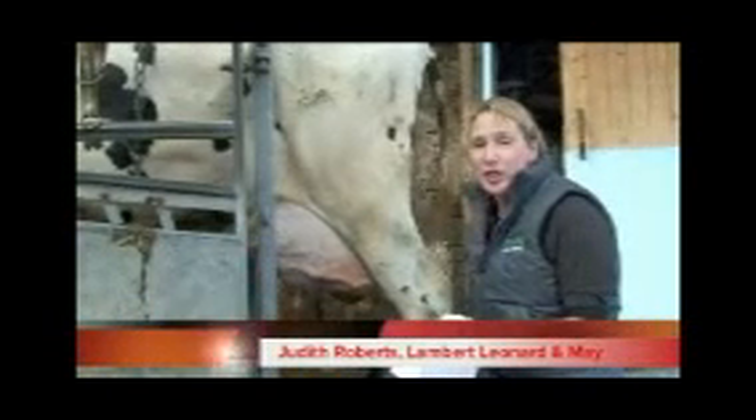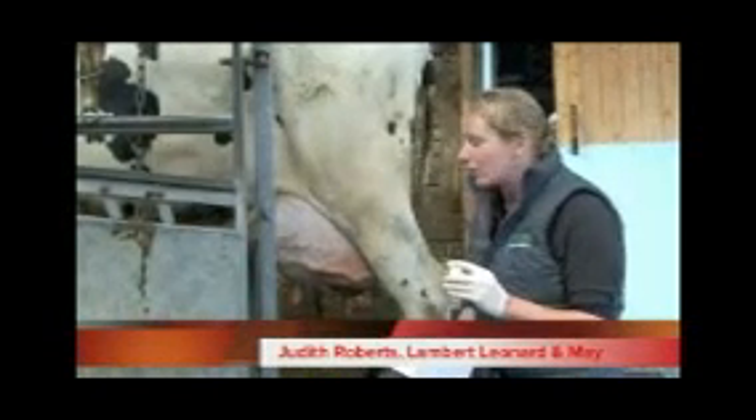We have our cow that's tested positive on one of the quarters when we performed a CMT. The next thing we're going to do is take a sterile milk sample. That might be because we're going to send it away for bacteriology, or it might be that we're going to put it in the freezer and store it for when we next need it.